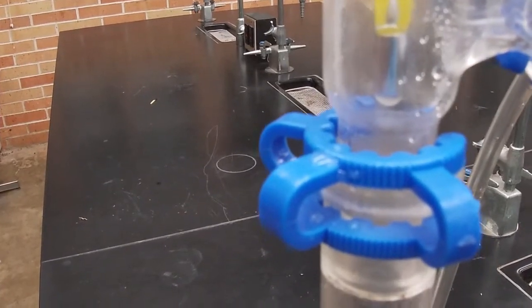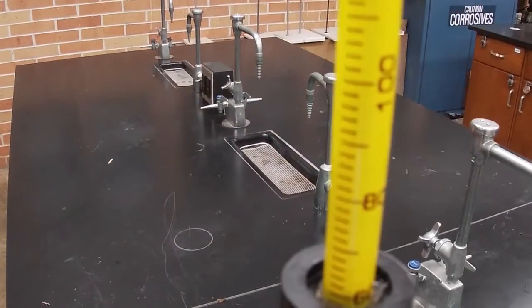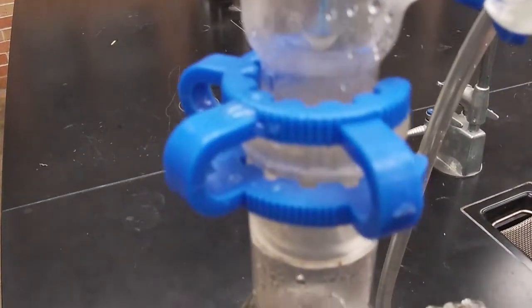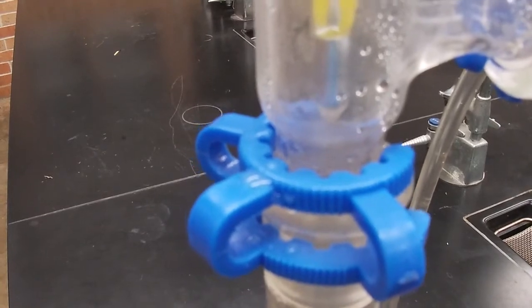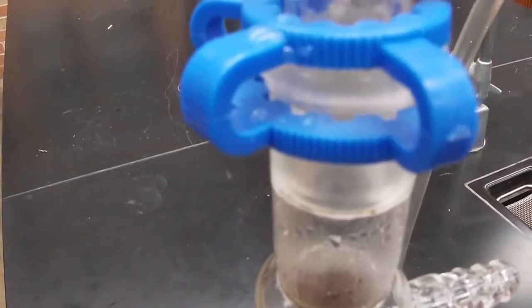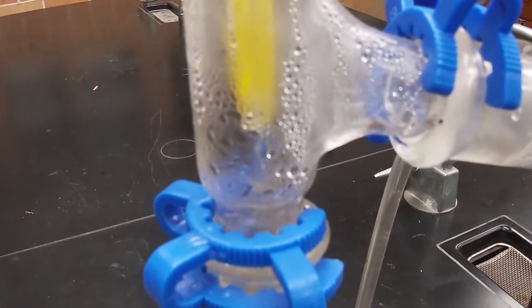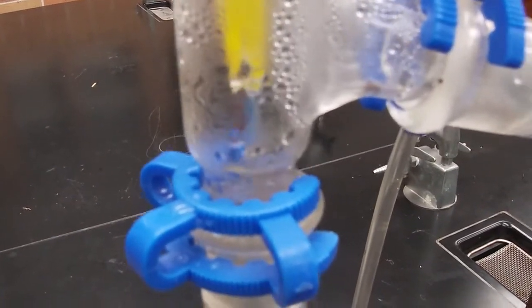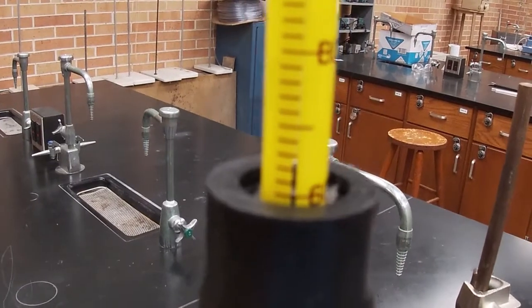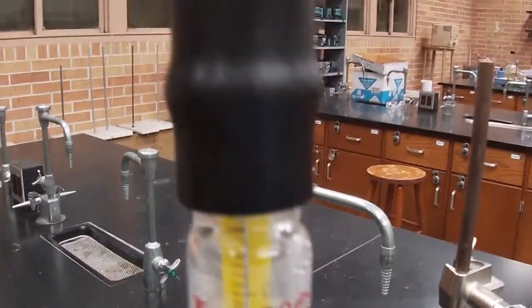There's the thermometer. Temperature on the thermometer is still room temperature. Not reading anything yet. As soon as those vapors hit that thermometer bulb, the temperature is going to jump up to 65. So the vapors are almost there. Look, they just got to the thermometer bulb. The temperature should shoot up. And there we go. Look at that. 65 degrees, maybe 66.